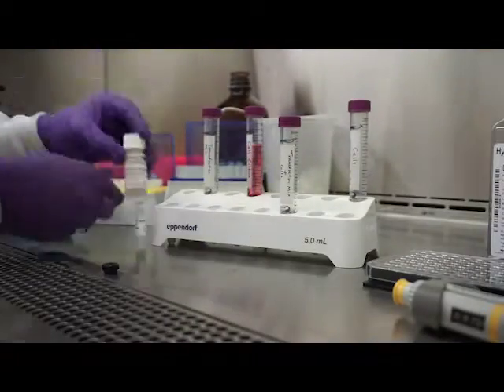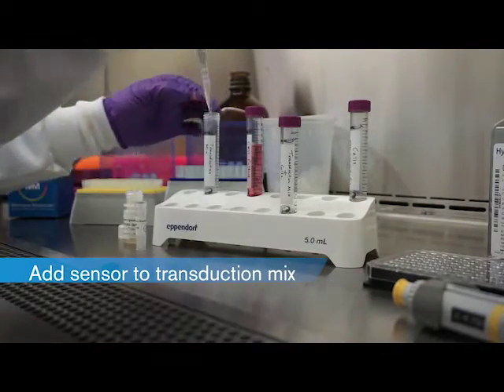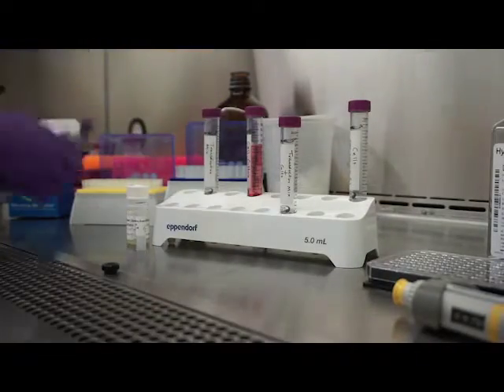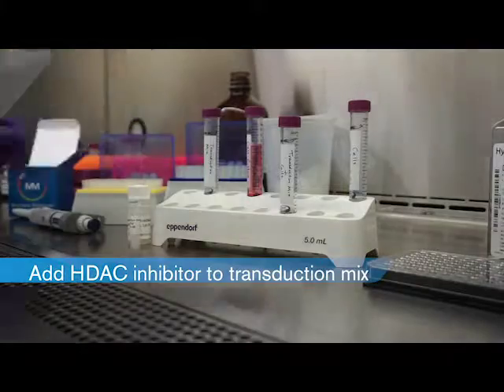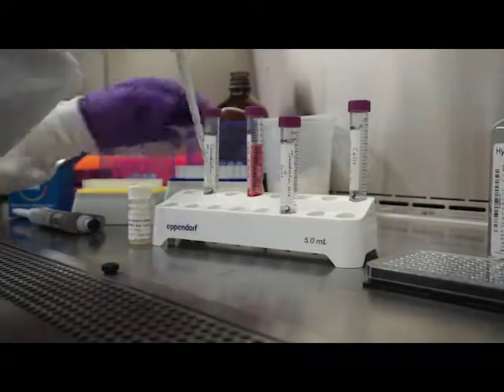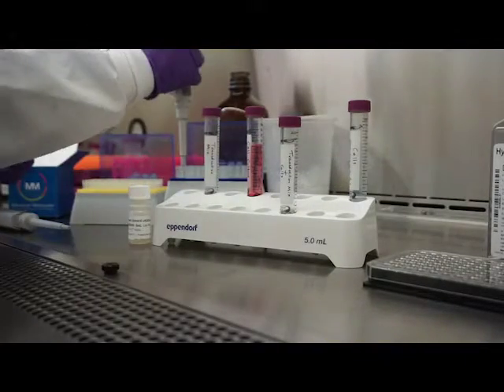The transduction mix typically consists of three to four components: the sensor BACMAM stock, the HDAC inhibitor sodium butyrate, and cell culture media. A potential fourth component is the provided receptor control. We strongly encourage you to use the receptor control in your initial experiments, as this can be a useful tool in optimizing the assay.